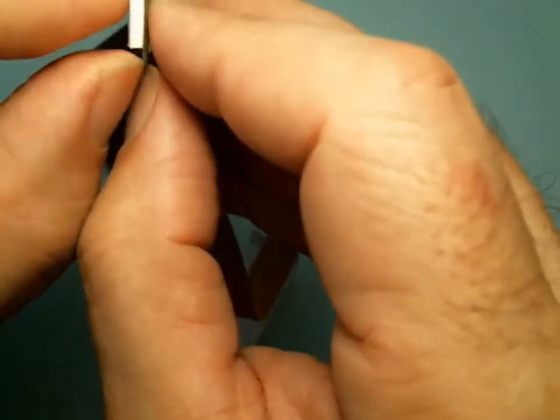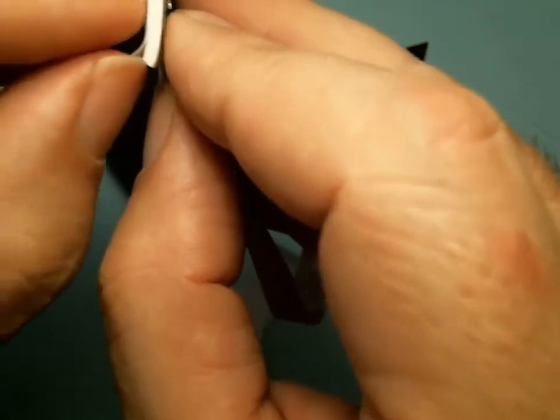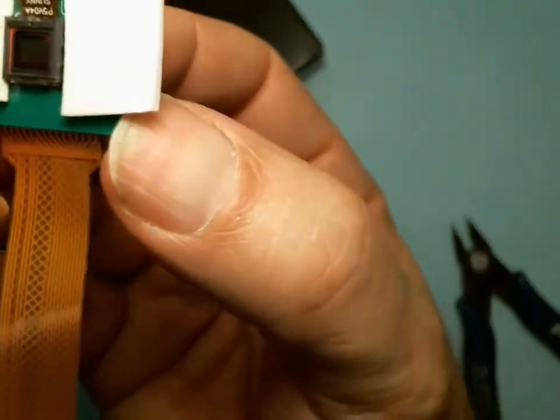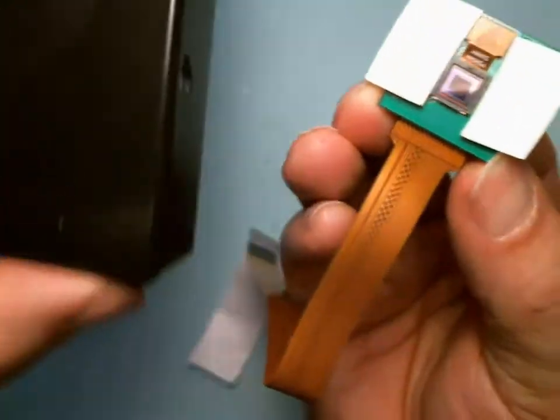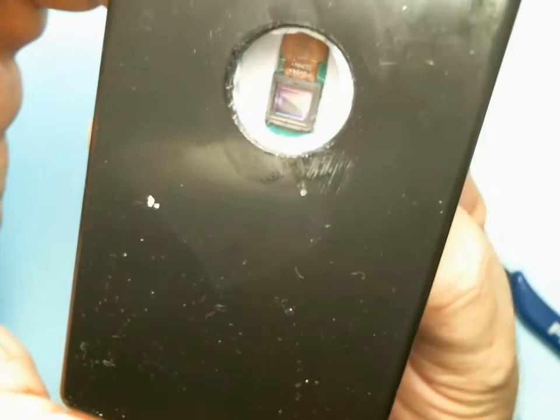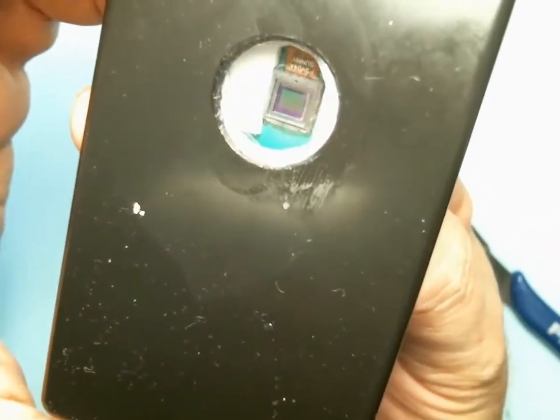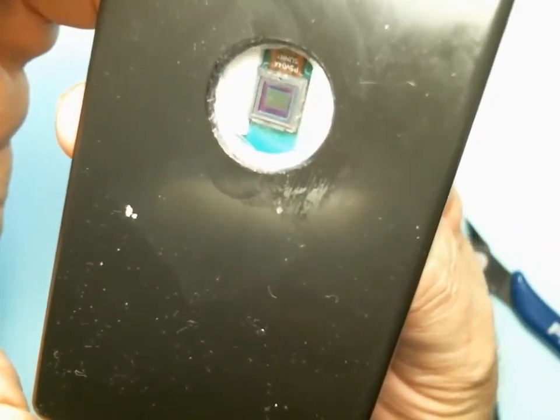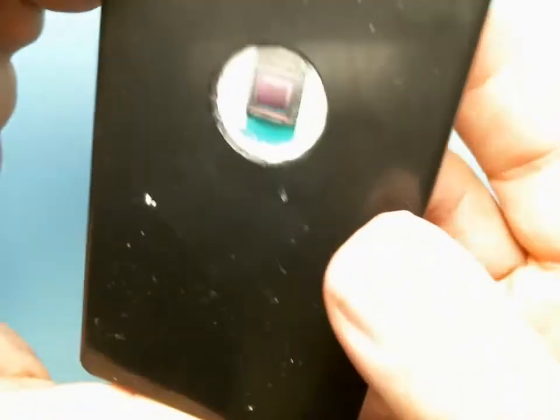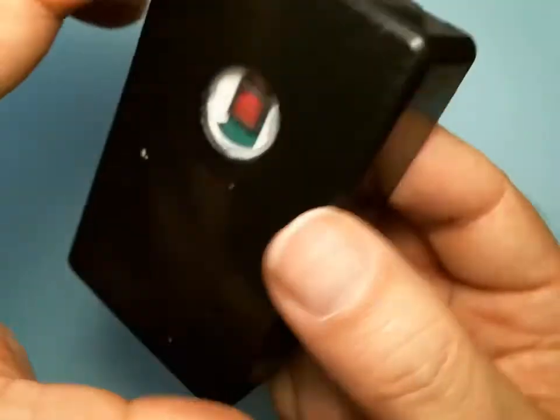I'm taking the protective film off the double-stick tape. I'm going to hold it by the corners, and as I'm moving it closer I keep trying to center it and make it square — coming closer and closer — and there I am. I'm going to just press it a little more firmly, and that's it.